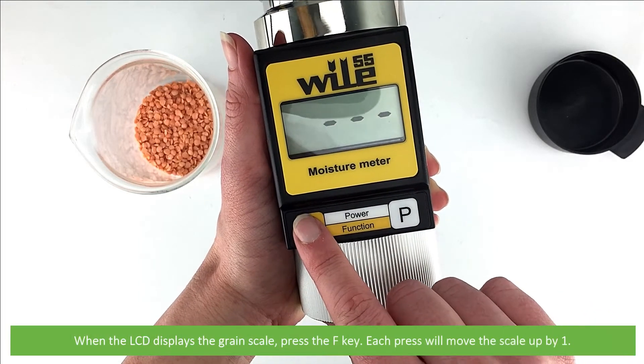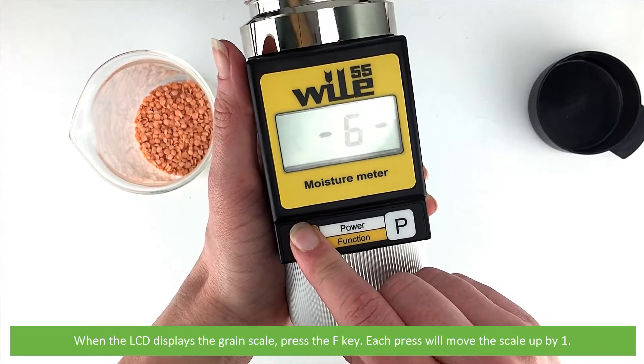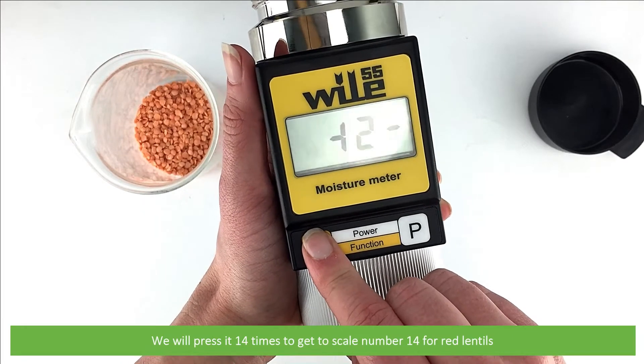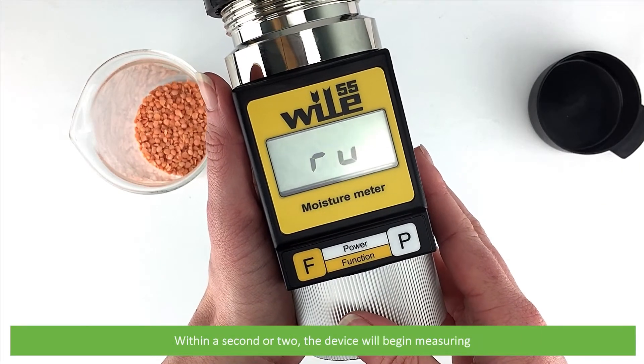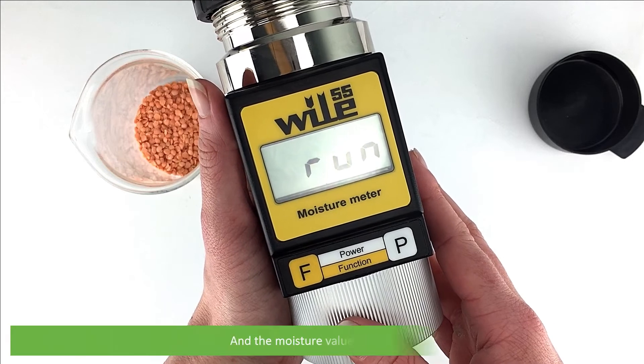When the LCD displays the grain scale, press the F key. Each press of this key will move the scale up by one. We will press it 14 times to get to scale number 14 for red lentils. Once your scale is displayed, press no keys. Within a second or two the device will then begin measuring and the moisture value will display.